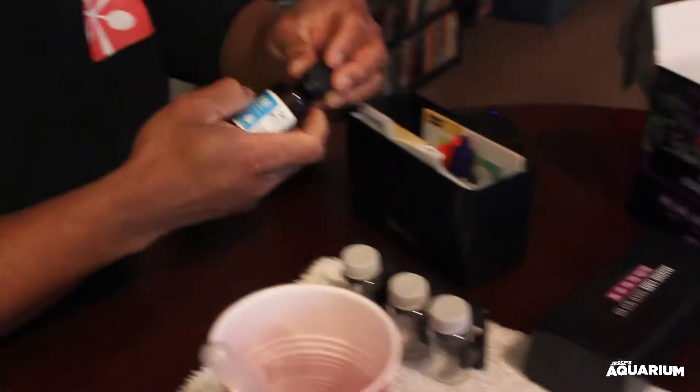Alright, next one we'll do is the KH. We'll shake the solution up and use the little dropper that was provided. It says add one drop and shake for 10 seconds, then continue adding one drop at a time, shaking between drops, until the sample changes to the end color you're looking for.